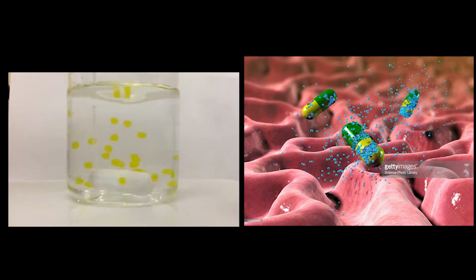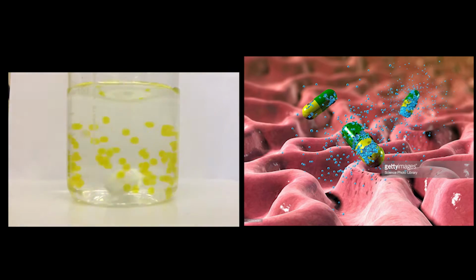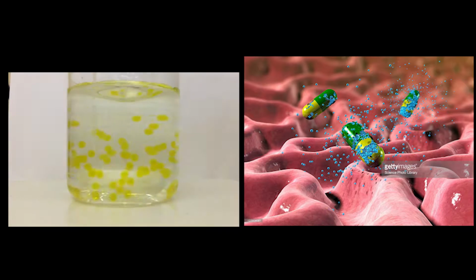As the tartrazine dye diffused out from the beads and into the water, samples were extracted from the beaker in intervals ranging from 2 to 10 minutes, and the absorbance measured using a spectrophotometer to ultimately obtain the dye concentration of the surrounding solution.